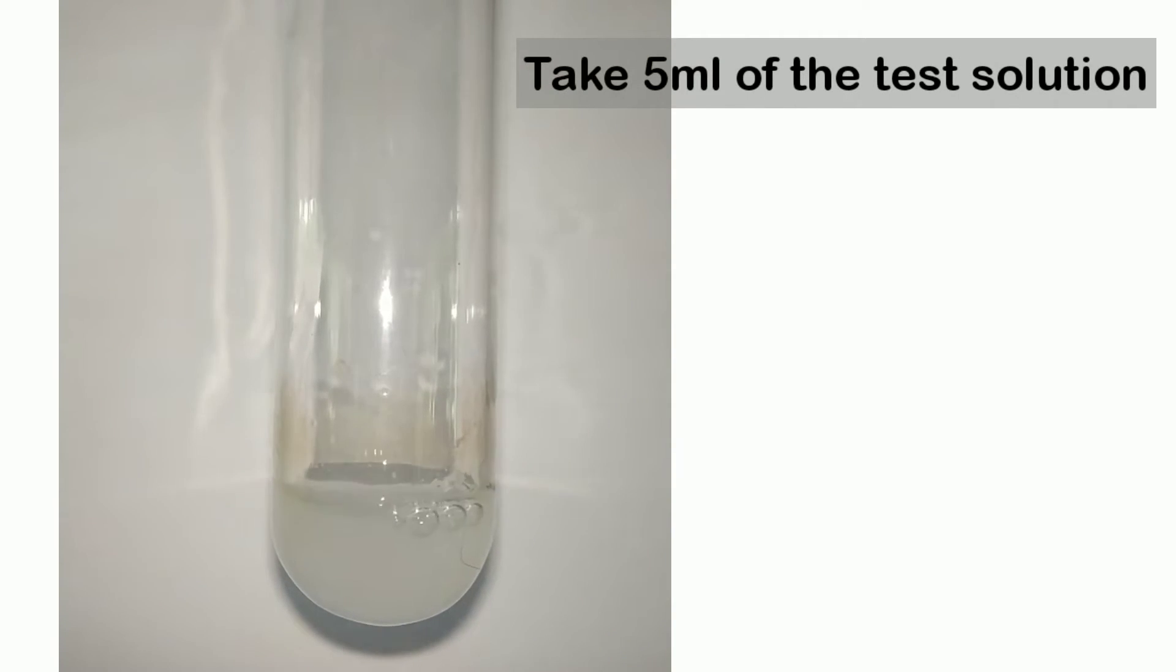Start by taking 5 ml of the sample solution. Here I have 1% glucose. You can use any reducing sugars like maltose or lactose.